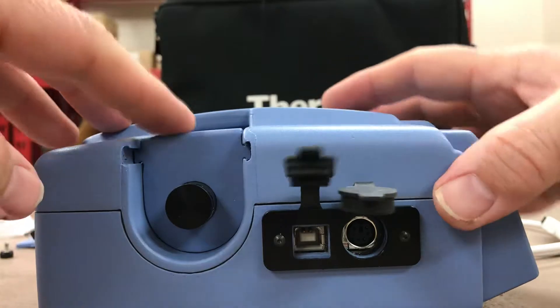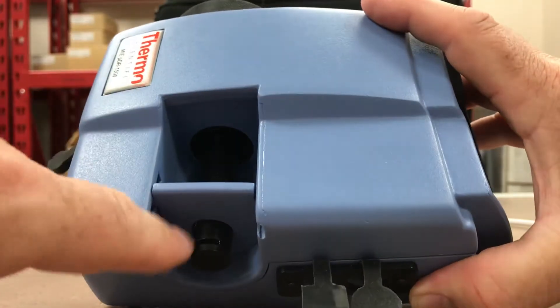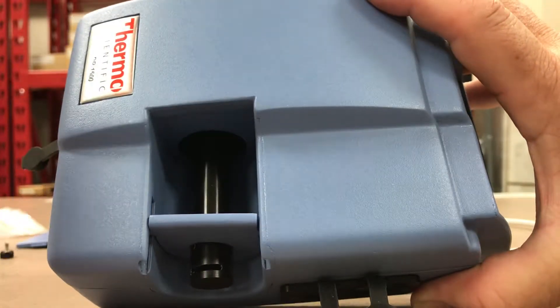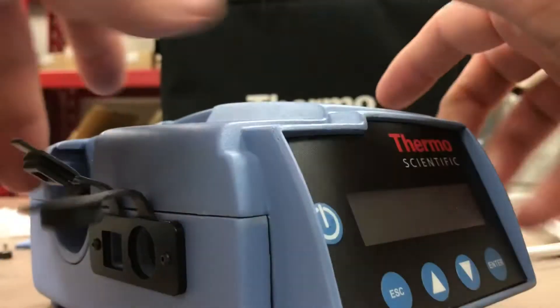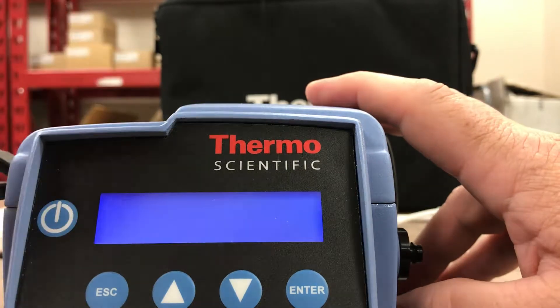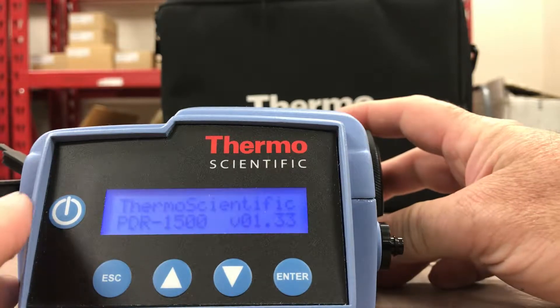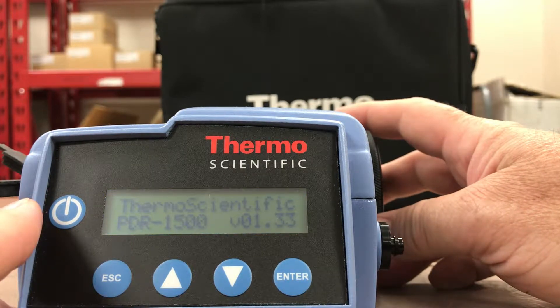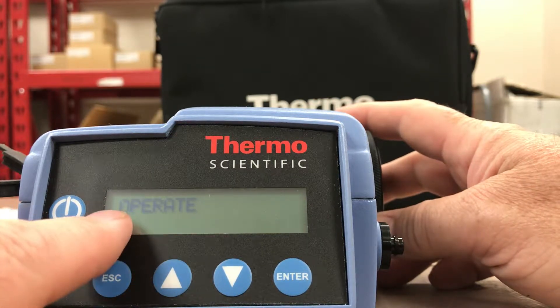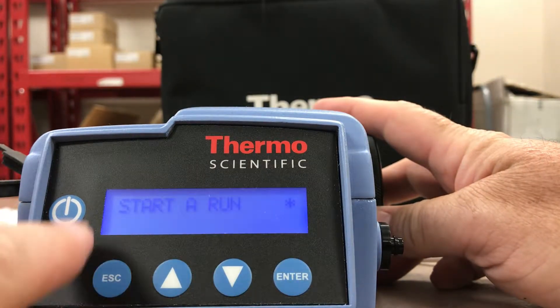We're actually running it — it just slides in and holds it securely. This is the total particulate sample inlet connected to the PDR 1500. Looking at the front of this unit, to power it on you simply hold the power button and let go, and it'll boot up: Thermo Scientific PDR 1500, version 1.33.